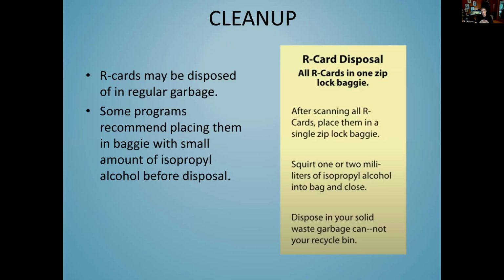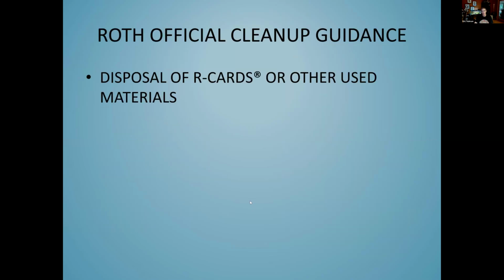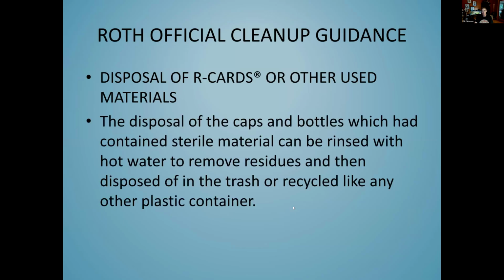If you're working in a laboratory setting or doing a high volume of R cards, you can decontaminate them with isopropyl alcohol before disposal. Roth has some specific guidance for how you dispose of R cards and other materials that might have gotten contaminated. They're saying you can rinse the caps and bottles, if you're using those, with hot water and then dispose of them or recycle.